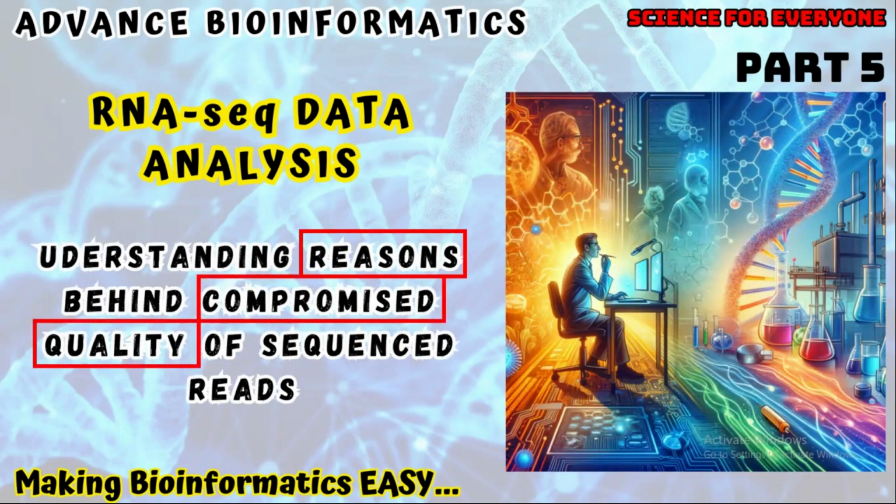This is a very important video, and after watching it, you will know why the quality of the sequencing files gets compromised. When you have this knowledge, you can deal with it and pre-process your data in a very effective way.